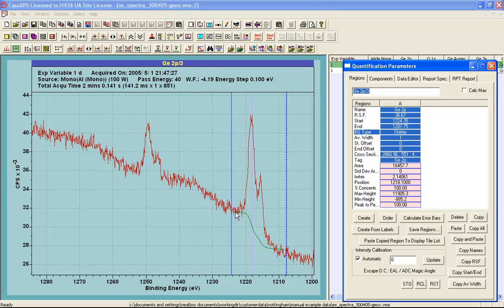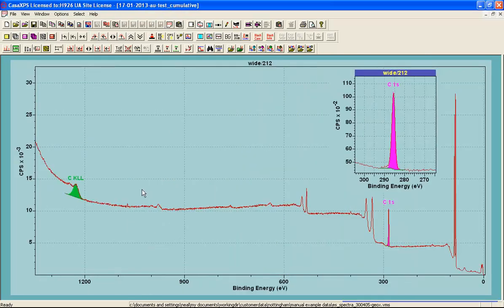It's already apparent by eye that the step across these peaks that represent the germanium 2p3/2 is different from the step we see here for the 1/2. And the reason there is an apparent difference in the background can be seen if we consider data that were collected from a gold sample that was just placed in the analyzer and measured without cleaning. The carbon contamination on the surface of this gold sample has produced an Auger peak in this proportion.